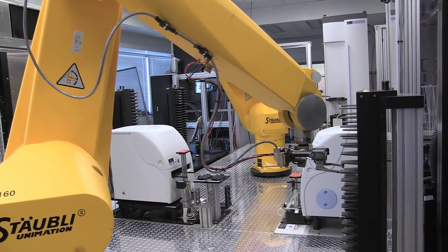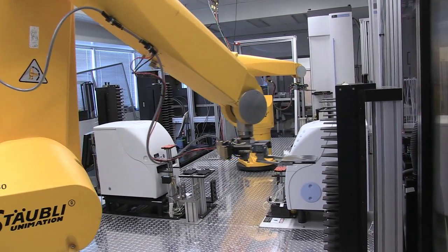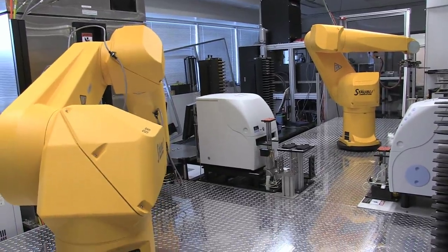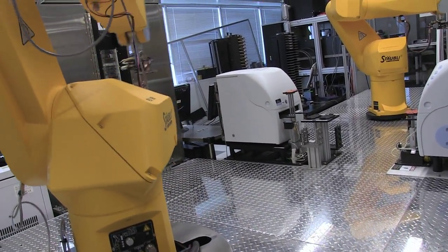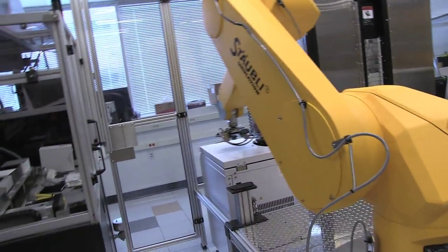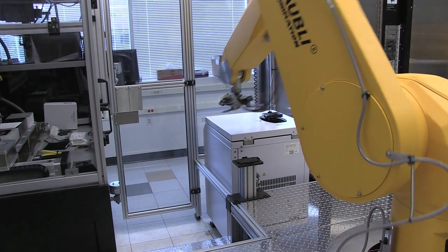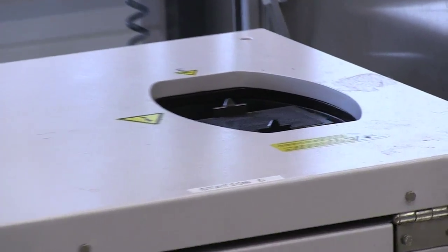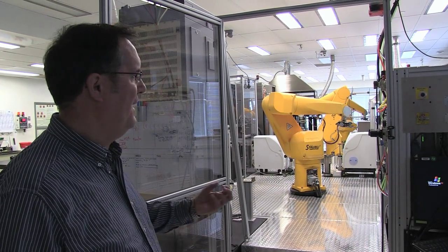On a robot, we can do everything that a biologist might do on the bench. So part of our job is to take a protocol that Kapil might develop that has steps that really we cannot do and sort of eliminate those steps or streamline the protocol so it can be done on the robot. What the human does in the lab, these robots can do for millions of wells and millions of compounds.